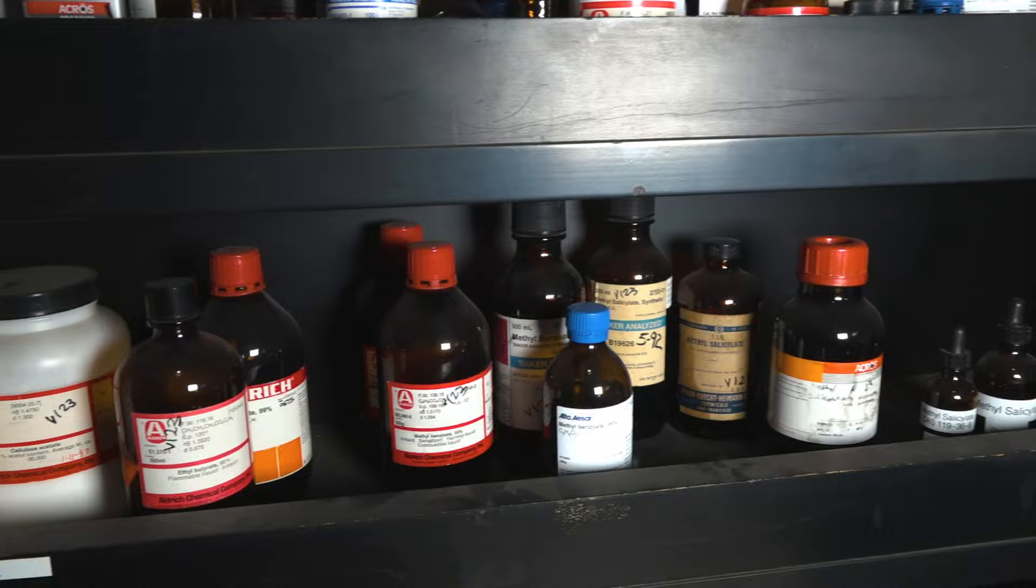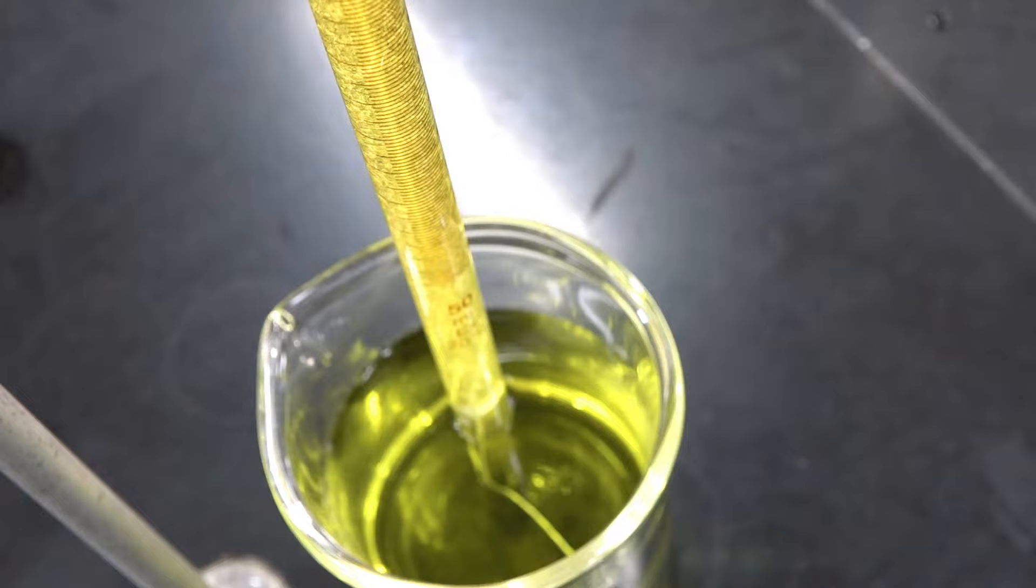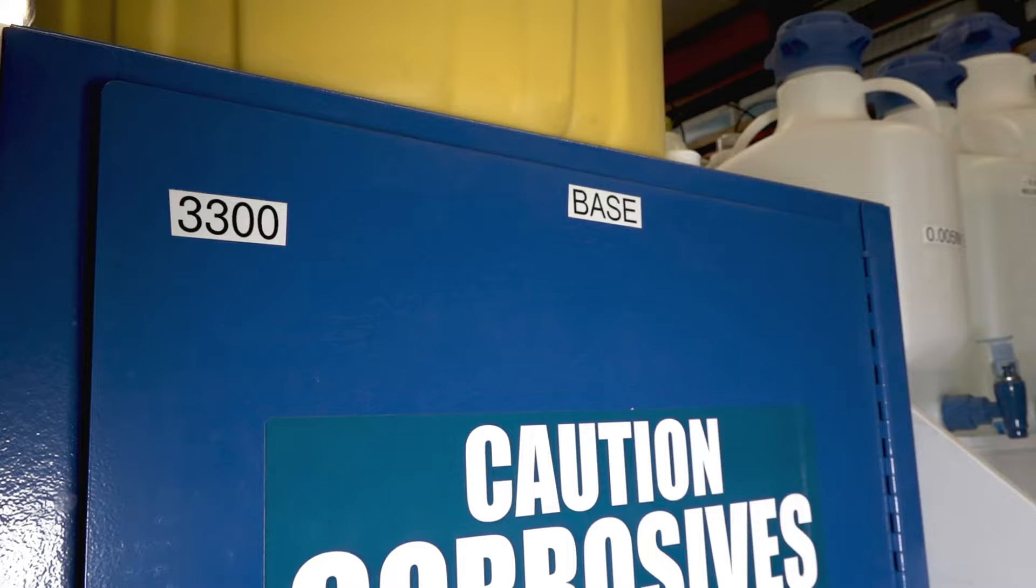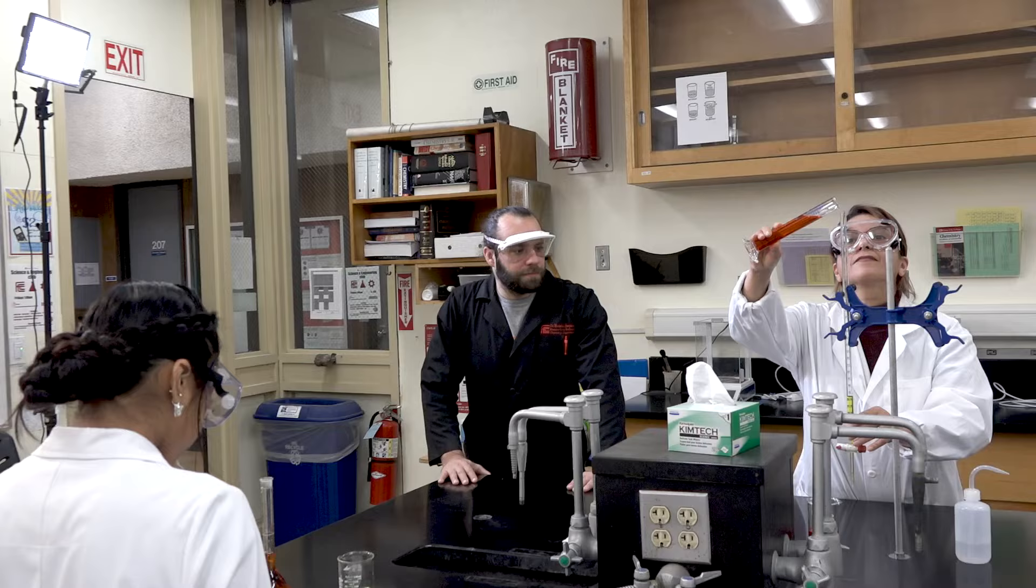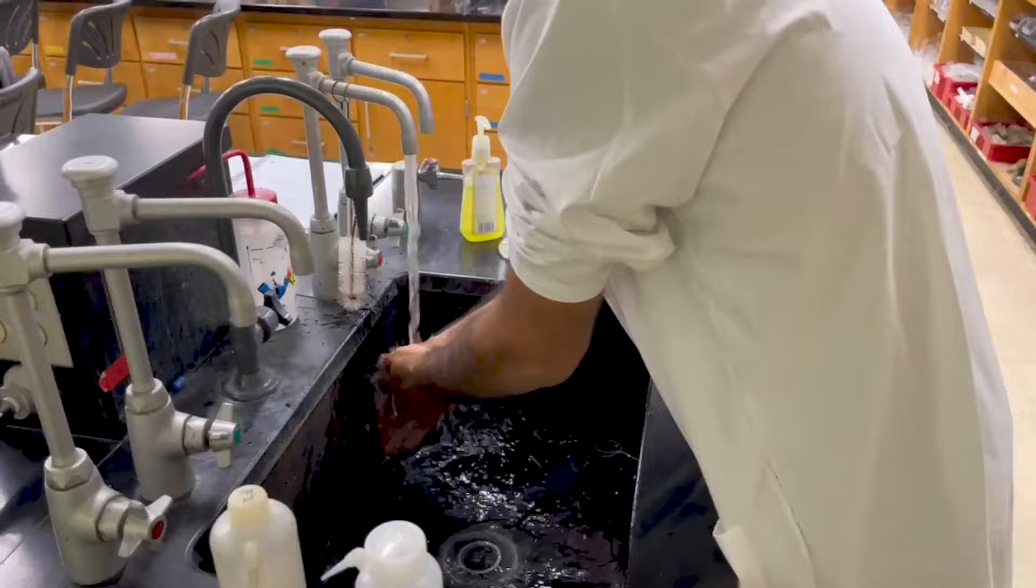Dangerous and caustic chemicals are a reality of any chemistry laboratory because they are important in many chemical reactions. The most commonly used are strong acids and bases, which can damage your eyes and skin. If a spill does occur, regardless of severity, the first thing you want to do is immediately alert your instructor. They will give you guidance on how to safely proceed. Minor spills, such as spilling a little acid or base on your hand, can be easily remedied by washing the affected area with lots of water.